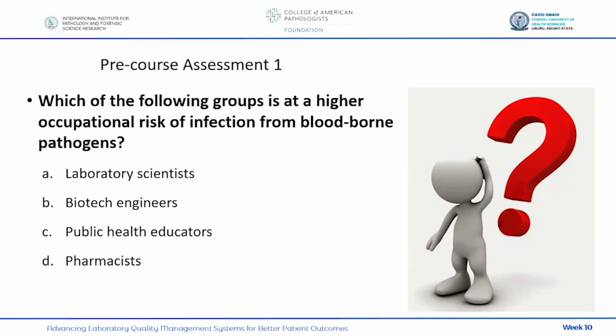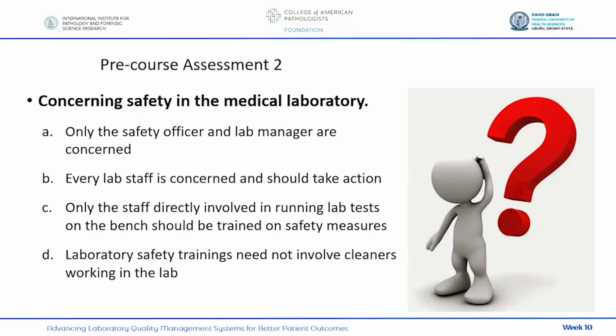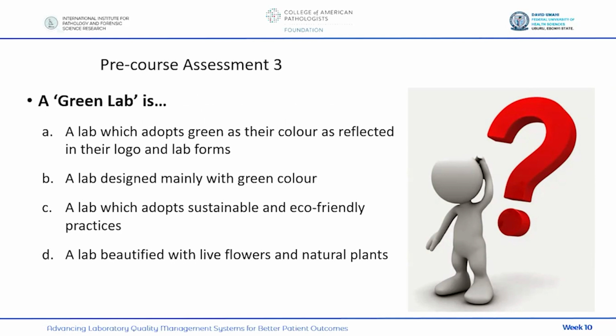So the first question is talking about who is at a high occupational risk of infection from bloodborne pathogens, and concerning safety in the lab, and then what a green lab is. We hope to cover all this in the course of this session.